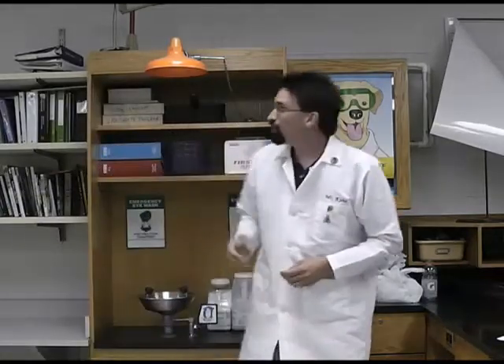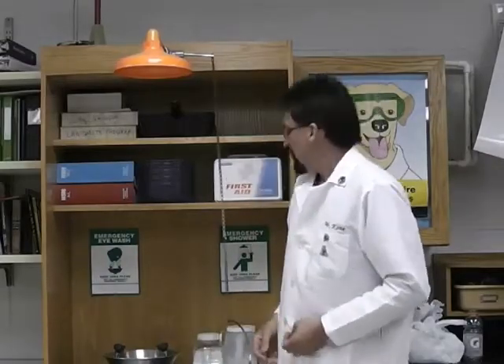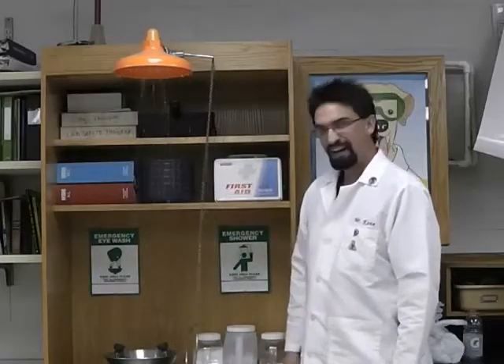Speaking of the chemical shower — if you wind up getting a dose of chemical on you, you may have to use this. I've never had to use the chemical shower before, but typically when you need it, you've got chemicals on your body and you need to get them off because they get trapped between your clothes and your skin and start burning your skin. There is a pull chain up there, and using the chemical shower is pretty simple. I'm not going to actually pull the lever right now, but as you're using the chemical shower, you do need to pull off the clothing because the water winds up trapping the chemical underneath your clothes. If somebody winds up needing to use this, the teacher will be getting other people out of the room while you're under here trying to get your clothing off to keep from getting burned. You pull down and it automatically goes back up.